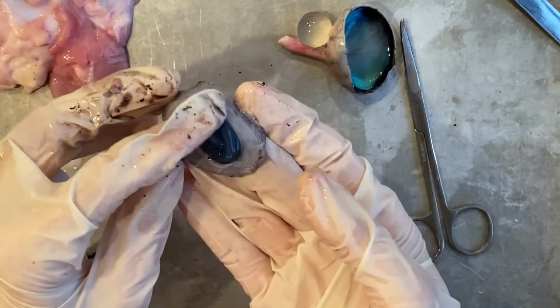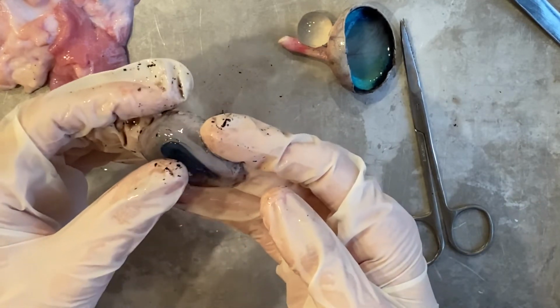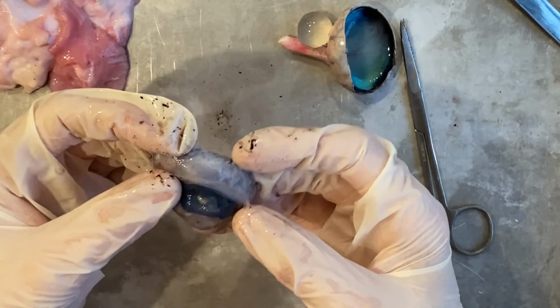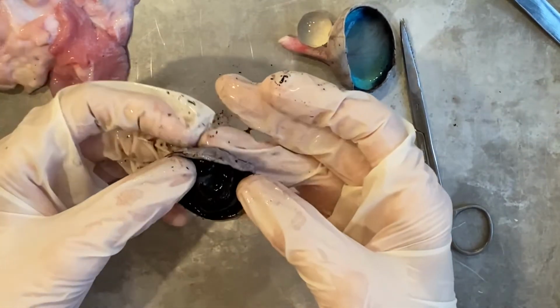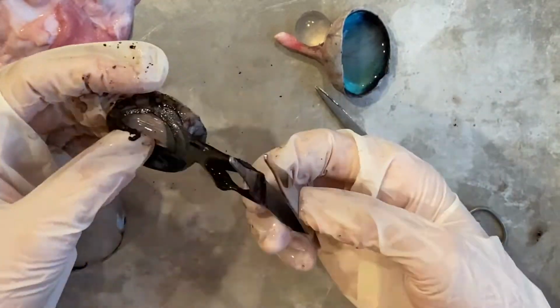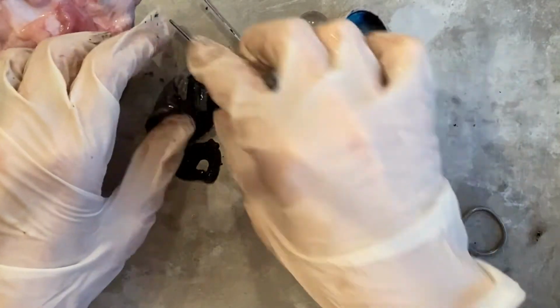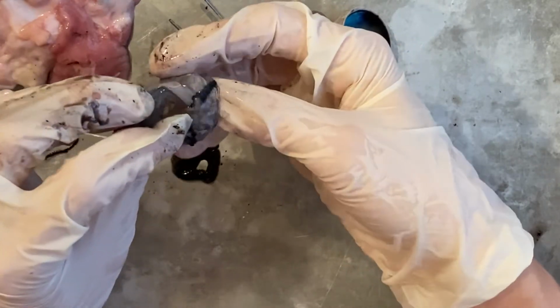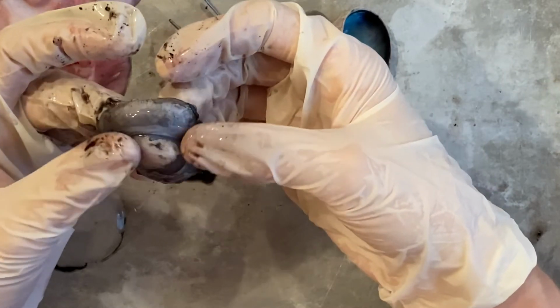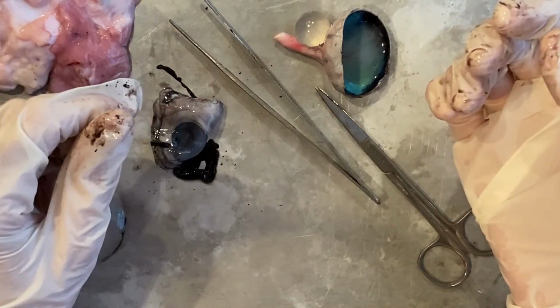Also, the fluid that would be in here inside the cornea would be the aqueous humor. We'll see if we find anything else, but I think everything kind of just opened up already. There's the iris, and we would have had aqueous humor in here in the front cavity, and that's the cornea. Let's see, anything else?